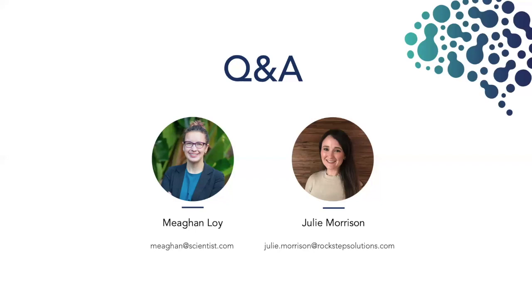Cool, thank you, Meaghan. And then the follow-on question, what label printers do you recommend? So I can give some examples of what we've seen with folks using Climb, and then Meaghan, feel free to jump in as well. We see Dymos a lot, both the regular and the twin turbos. If you are using something like a rapid tag and you want to see the color of that tag, then you do need to go to a printer, something like a Zebra, which allows you to print in color. I would say those are probably the two most popular I see.